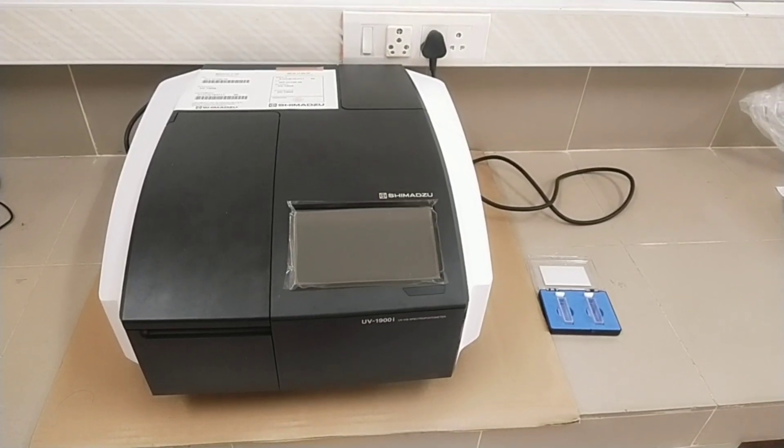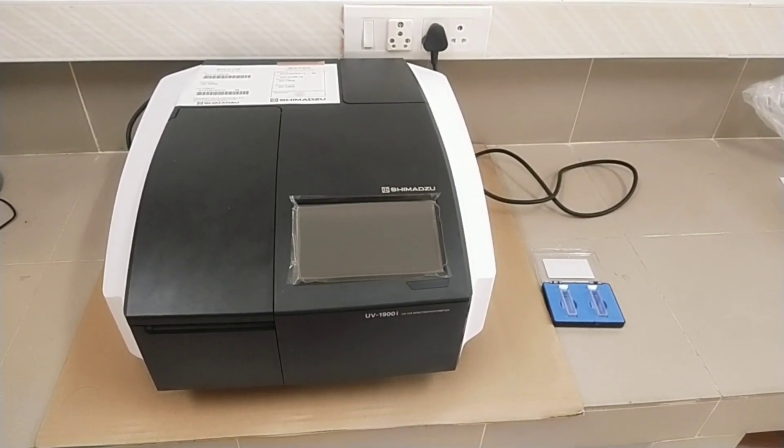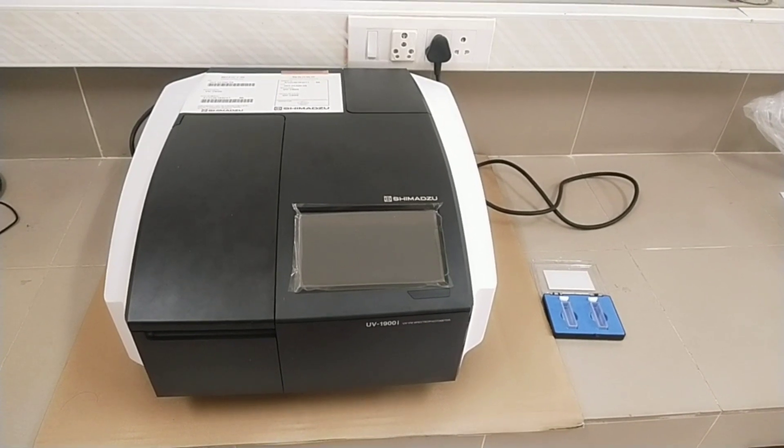Good day, today we are going to learn about the UV Visible Instrument, Shimadzu UV1900i series.